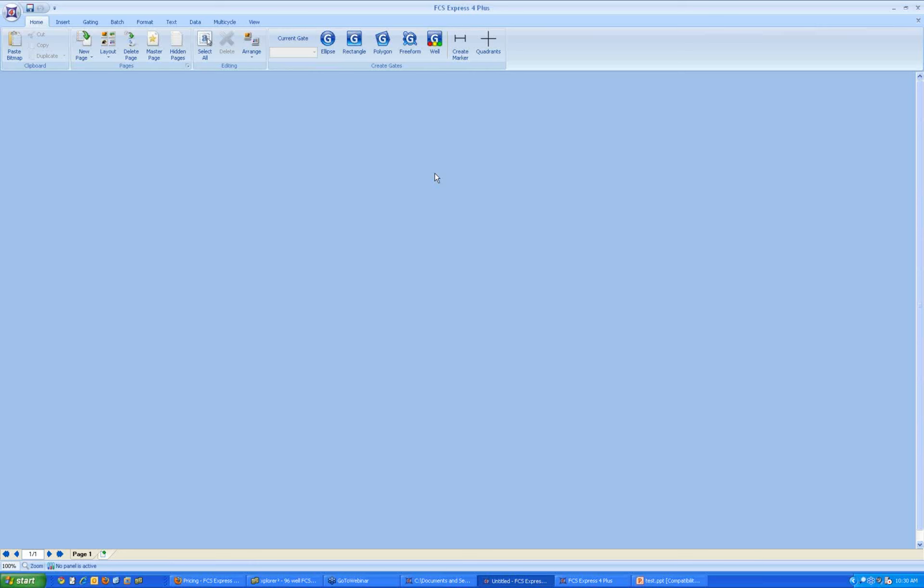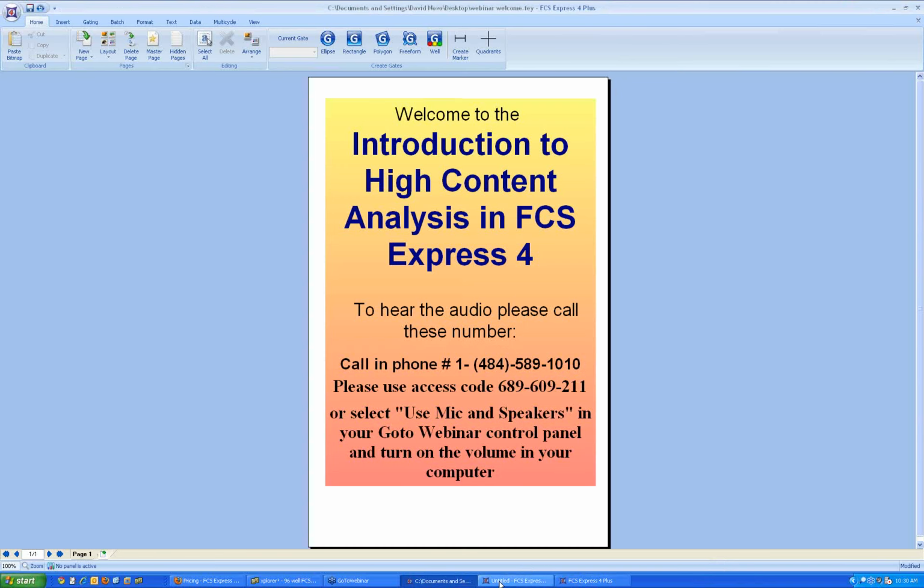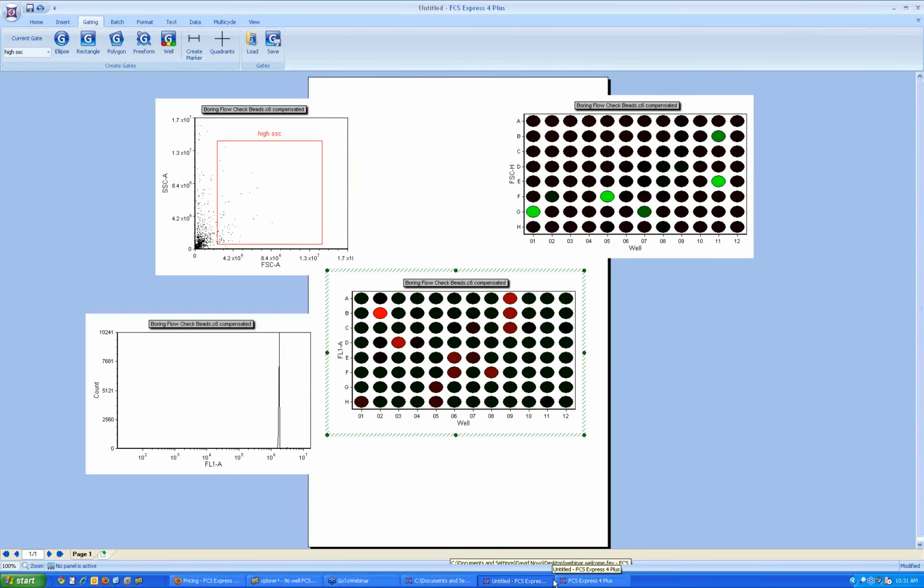What I'm doing right now is loading up a layout just to show you a more complicated example of using heat maps. Oops, this one can be closed. Hang on a second. When the GoToWebinar is working, often my computer slows down for whatever reason.